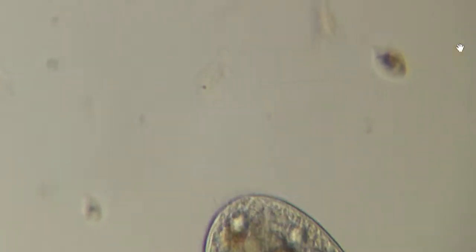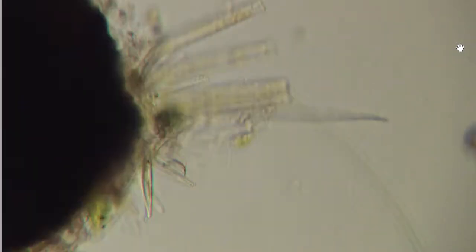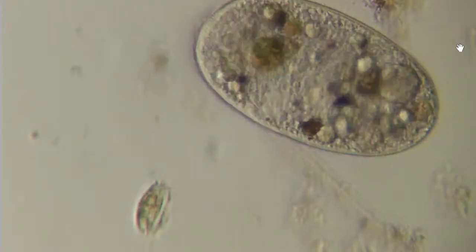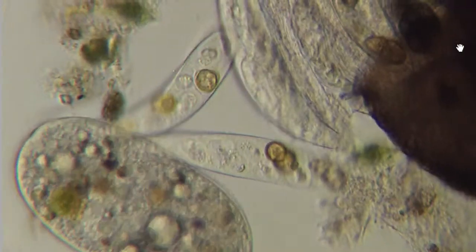Digestive enzymes get dumped in there from the cellular machinery. And then when it's noticed it's had enough time, however the hell that works, it basically goes back to the edge of the cell and joins with the membrane and basically craps it out. I have some footage of that on one of my streams. It's kind of fun to see it basically excrete its contents into the space around it.